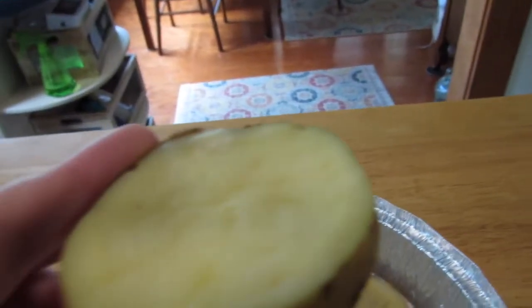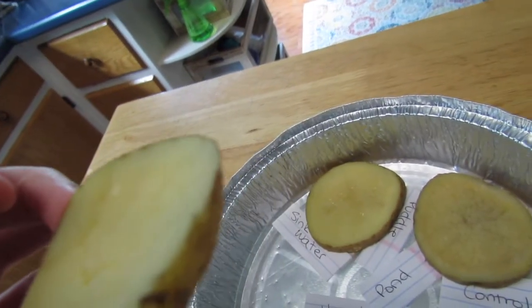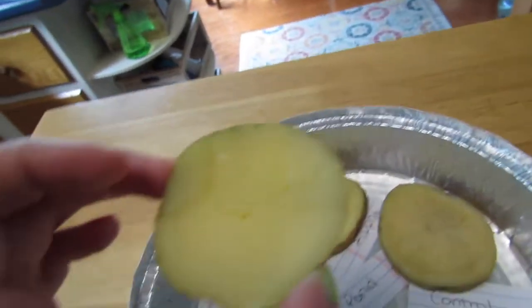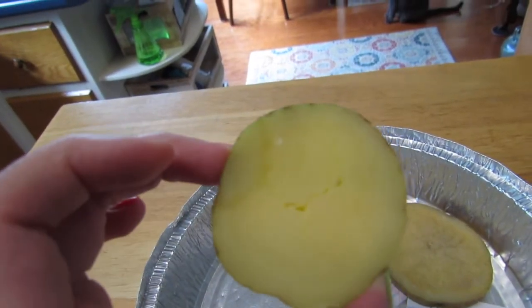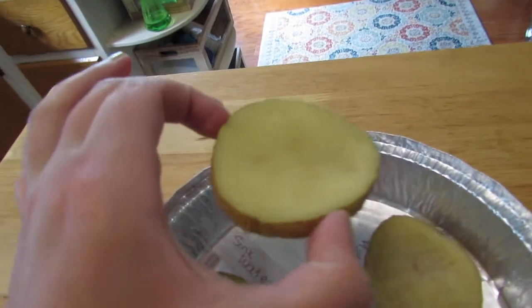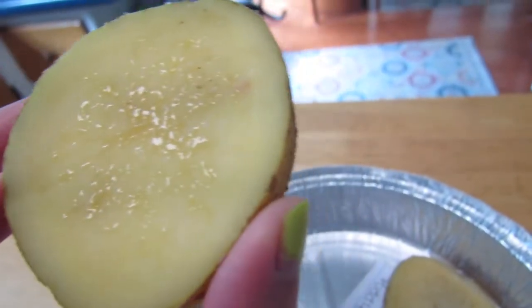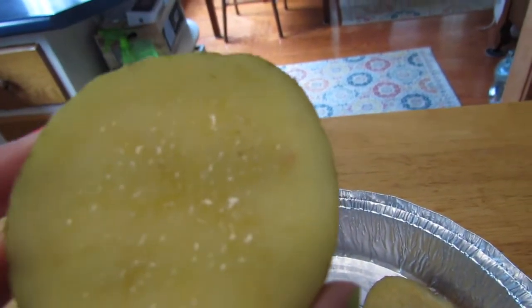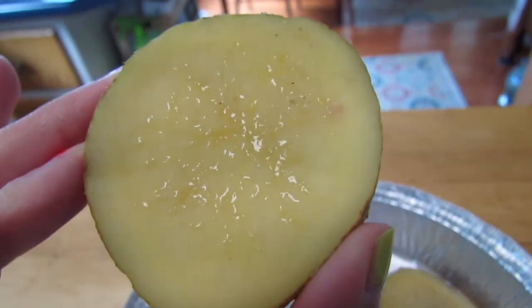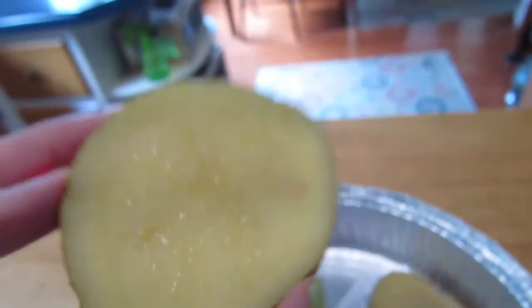My hand looks like it has a little bit of growth — some white growth at the top. The sink water has basically the same white dot that the control had, so it doesn't look like it has that much growth, which is good. The puddle has a lot of growth — every single shiny dot is a colony of bacteria. And it looks like there's some red too. So there's a lot of bacteria in the puddle.